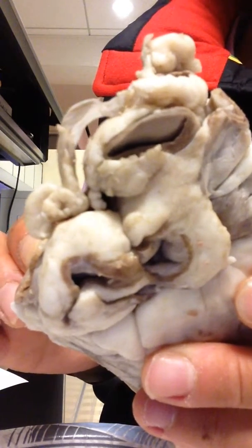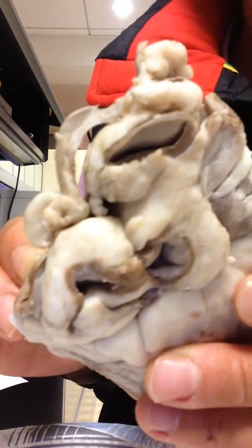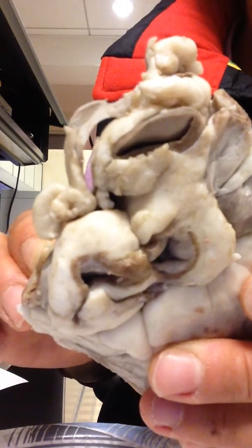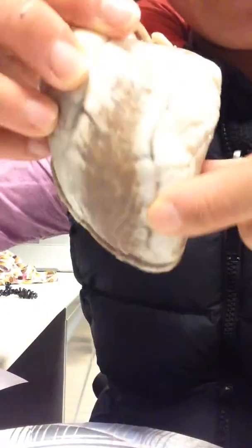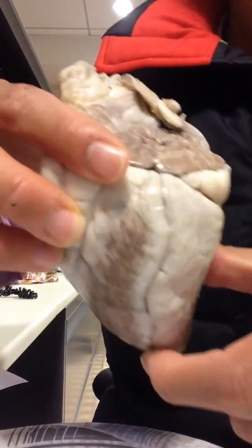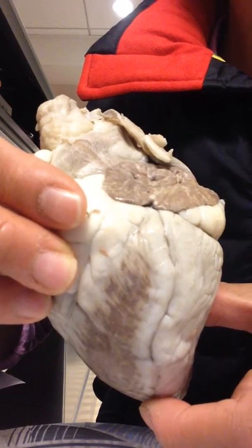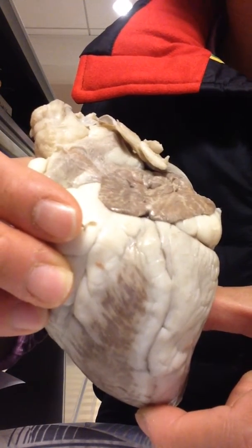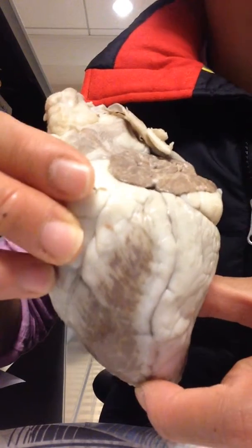And then on the fifth one, left and right ventricle. So I think I already pointed that out. The interventricular sulcus, it is this right here. And then the question is, what major blood vessels are found in the sulcus? It is the coronary blood vessels.